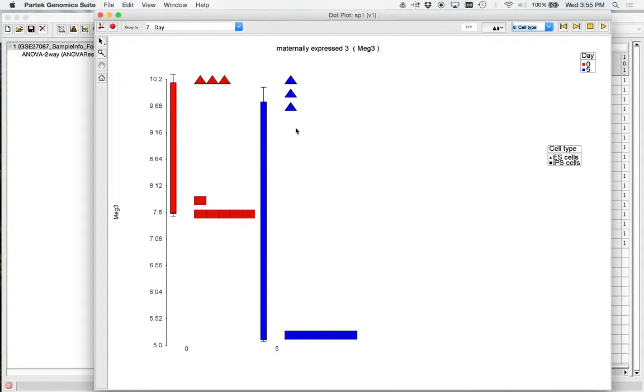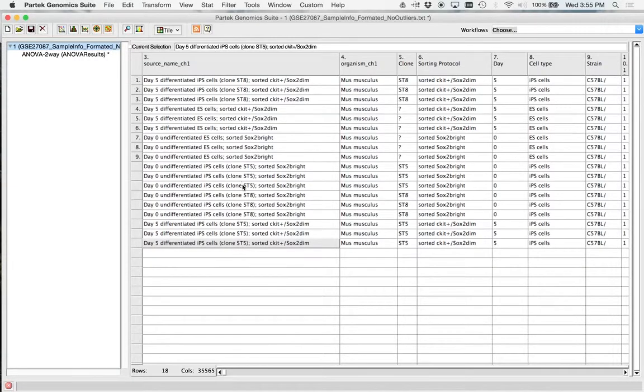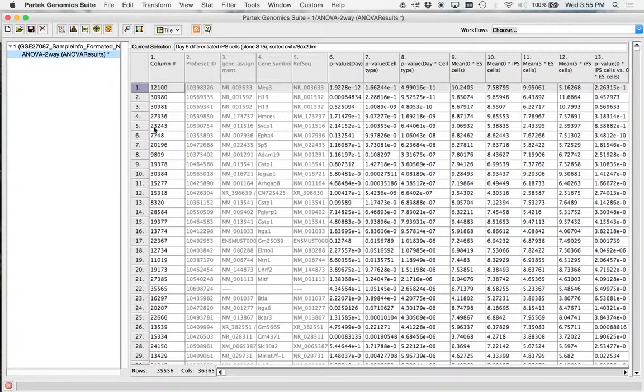And again, this is just one gene. But a lot of times I'll be on a disease, and you can actually just go down the list, like H19 imprinted maternally. Something's going on. One of these cell lines got some condensed DNA from its mother. The other one did not. And we're seeing this in the different cell types. Will this have any effect on differentiation states? Probably not. But I guarantee you there's a lot more in here that do.